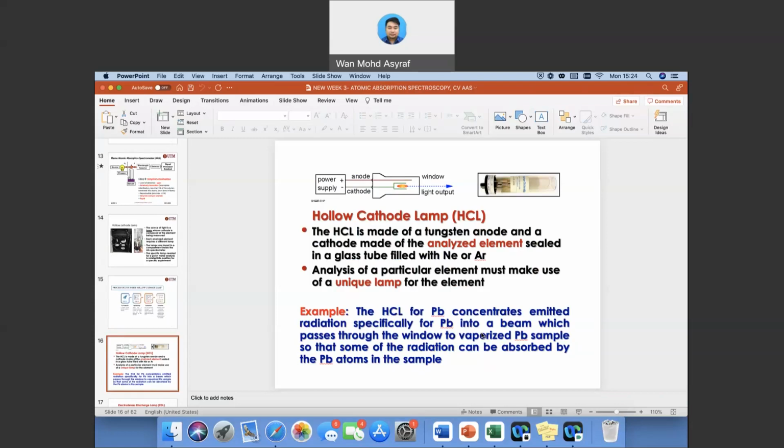Okay, so now you imagine yourself in the lamp with the copper. So now you have light from the hollow cathode lamp. It excites the copper metal inside your sample. So the copper will become excited, meaning that it absorbs, and then you produce a transmittance. So that transmittance would be used as a readout later on. Okay, I do hope that you can imagine it.